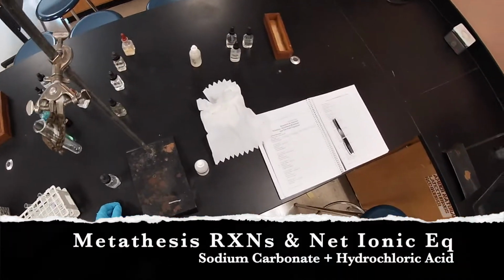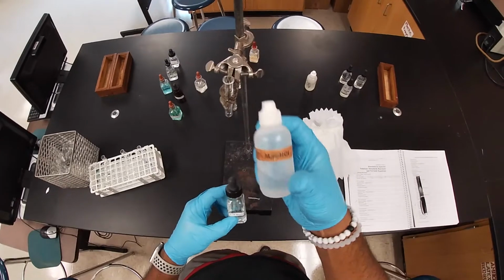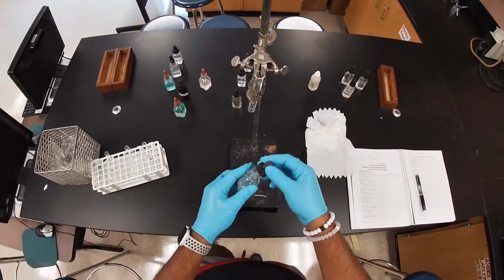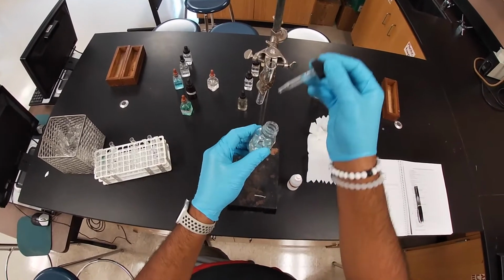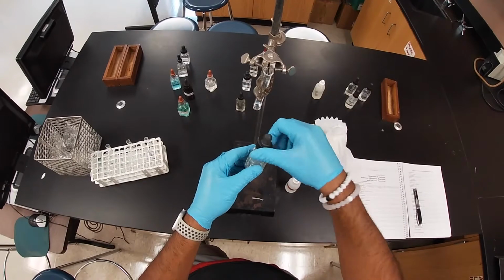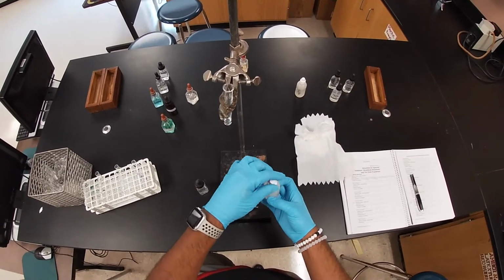Reaction 5 is going to be sodium carbonate again. Here we have some sodium carbonate and some hydrochloric acid. We're going to do the same process. We got our setup. We're going to add a dropper full of our sodium carbonate, and here we have our hydrochloric acid.